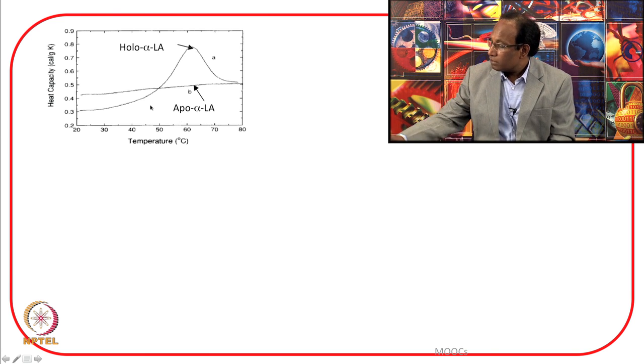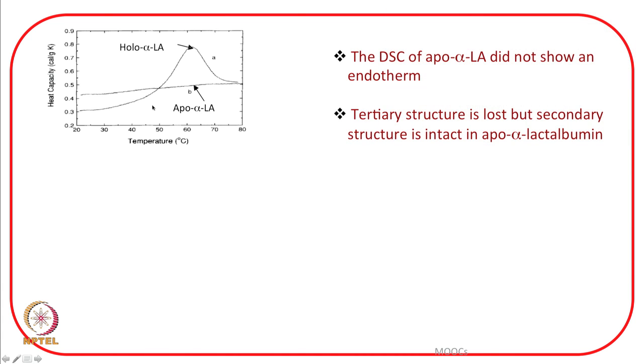What these authors showed is that the DSC of apo-alpha-lactalbumin did not show an endotherm.